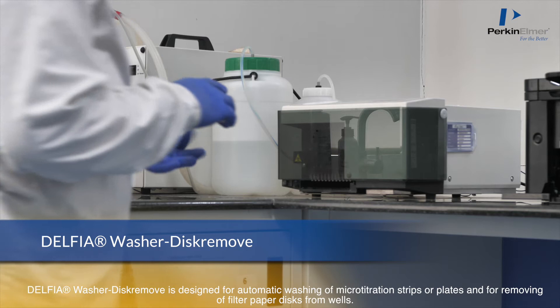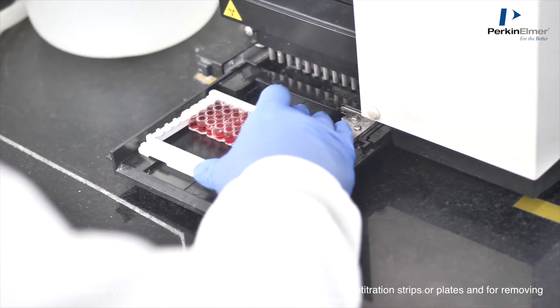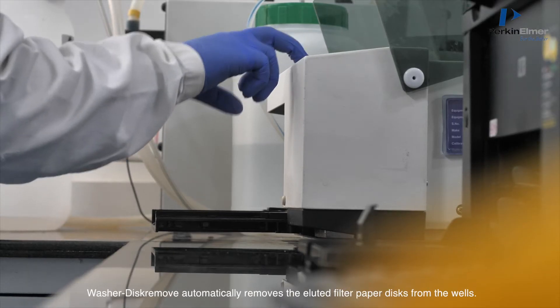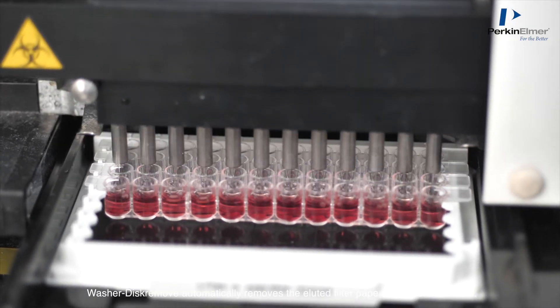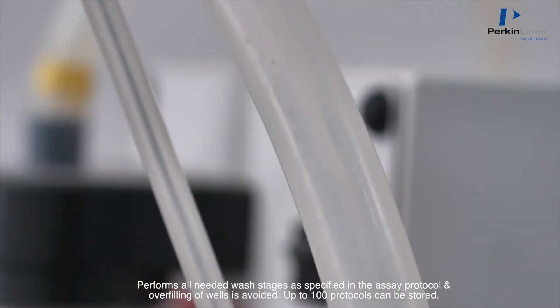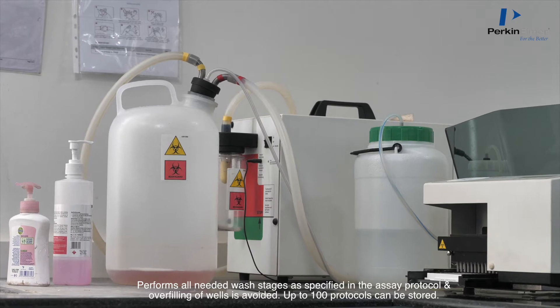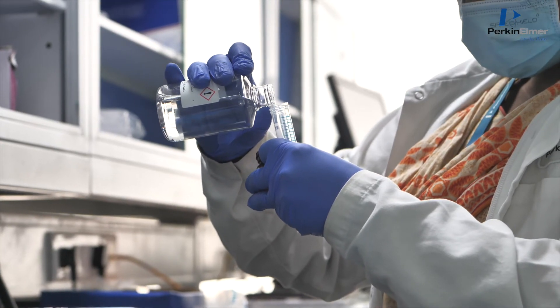The DELFIA Washer-Diskremove is designed for automatic washing of micro-titration strips or plates and for removing filter paper discs from wells. It automatically removes eluted filter paper discs from wells, performs all needed wash stages as specified in the assay protocol, avoids overfilling of wells, and can store up to 100 protocols.